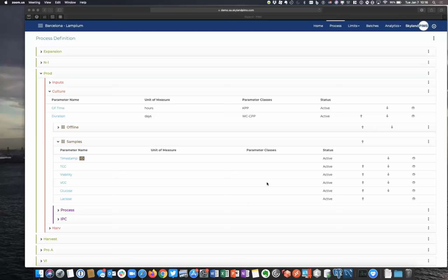So on the query side of PIMS, we extended the features that we added in 3.1 from just querying discrete parameters to also being able to query parameters for replicate and continuous tables. The query definition side works the same as it did in 3.1, with the exception of removing a restriction that only one row is returned. So we can now return multiple rows from queries.